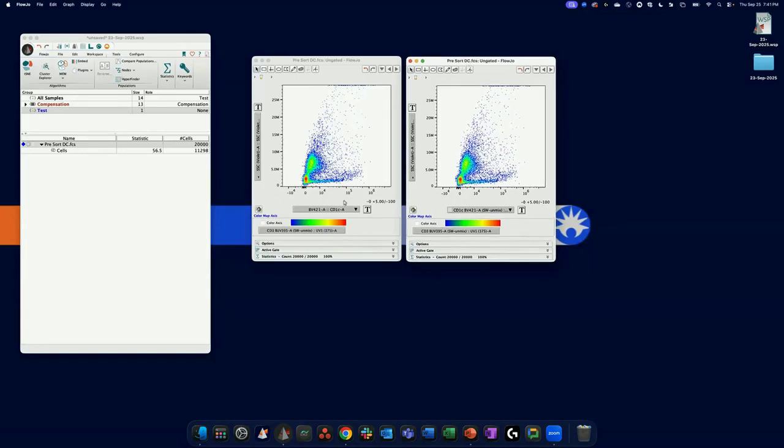So long story short, it doesn't matter which one you use if the data is completely unchanged. As soon as you start tinkering with the compensation, editing the matrix will only impact the SW because it's the only one that received the application of the matrix. And if you calculate a new matrix, you'll get new parameters that say comp.